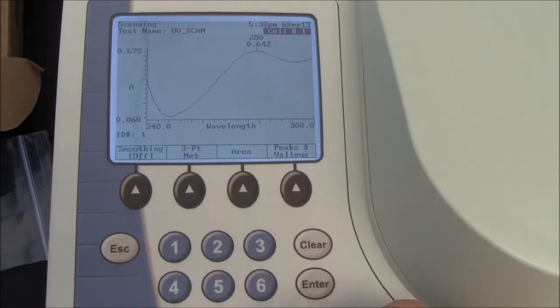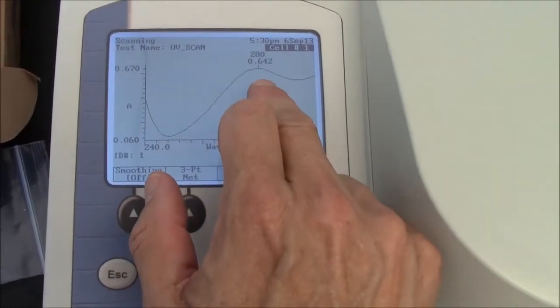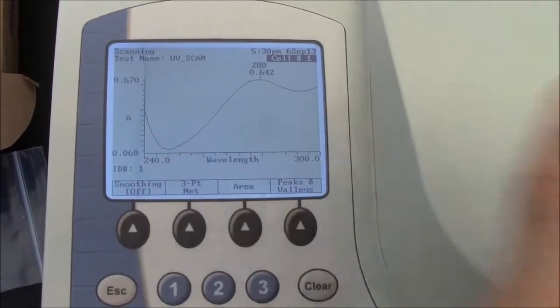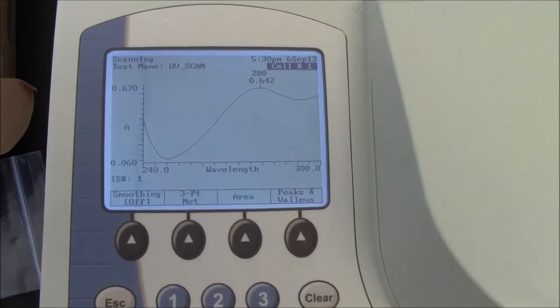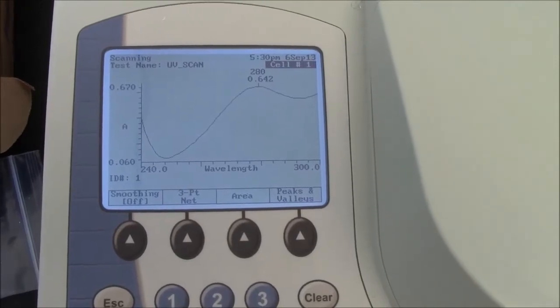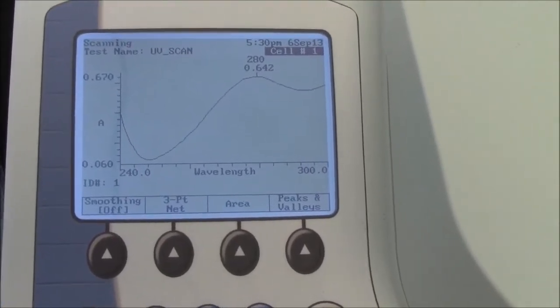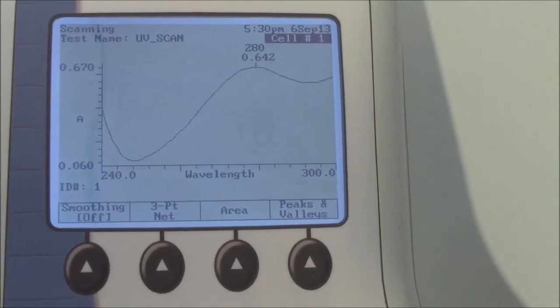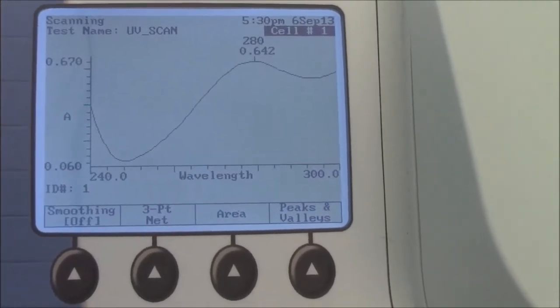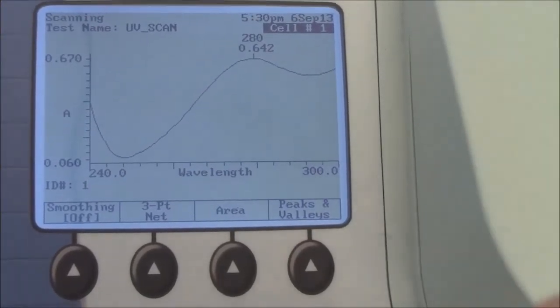It has found the peak to have a wavelength of 280 nanometers and the absorbance at that wavelength is 0.642. So I've labeled my peak.